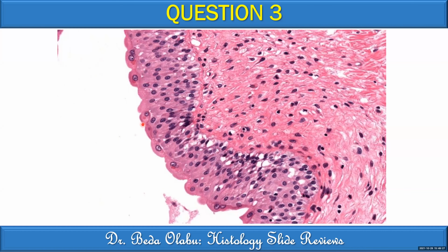Yes. I also want you to notice the shape of the cells on top. They bump into the lumen like a dome. So what did you call this epithelium now? Stratified, cuboidal, transitional. Yes, now we call it transitional epithelium. So you don't have to call it stratified cuboidal epithelium. This is specifically urothelium. Thank you, Doc.